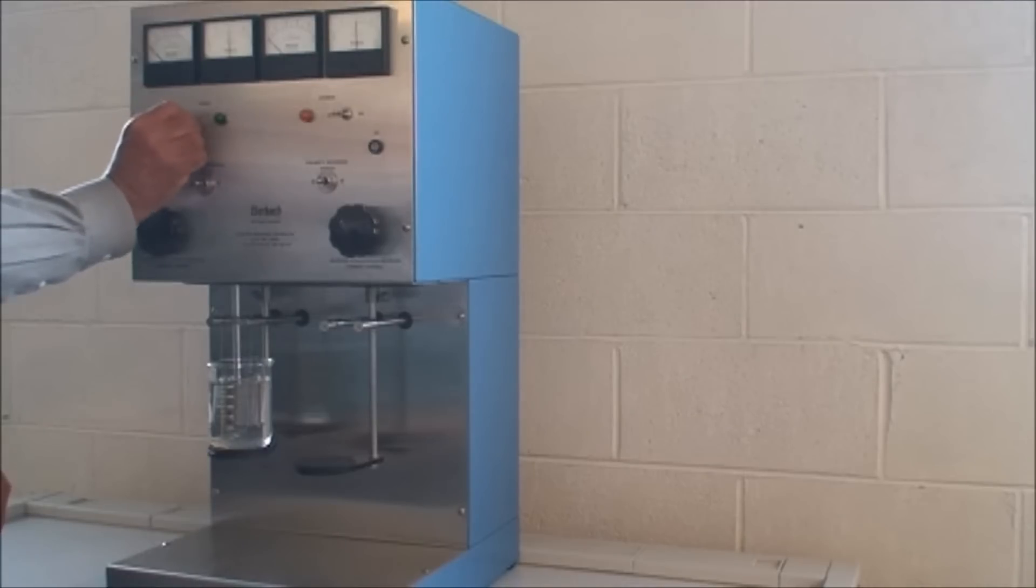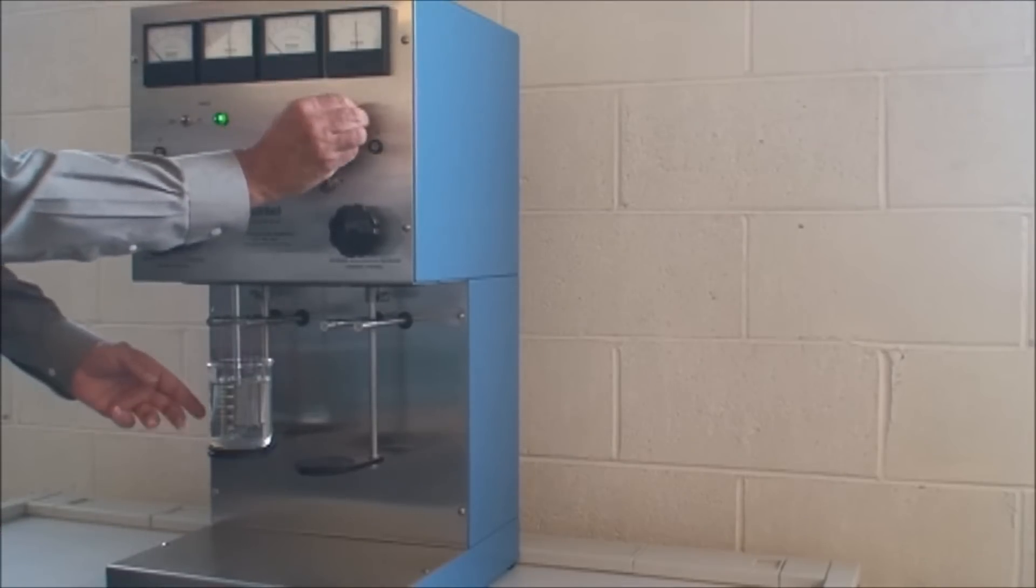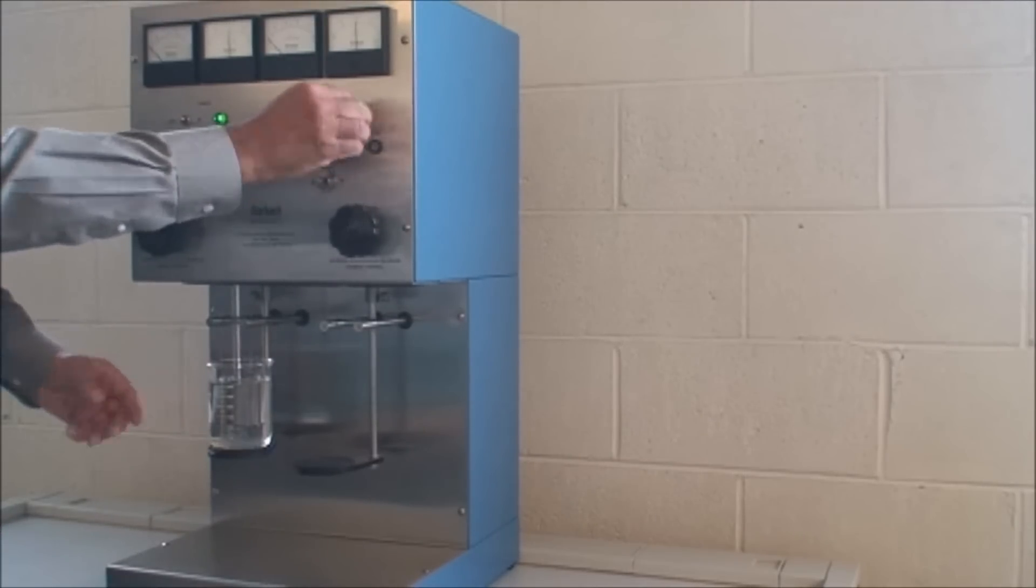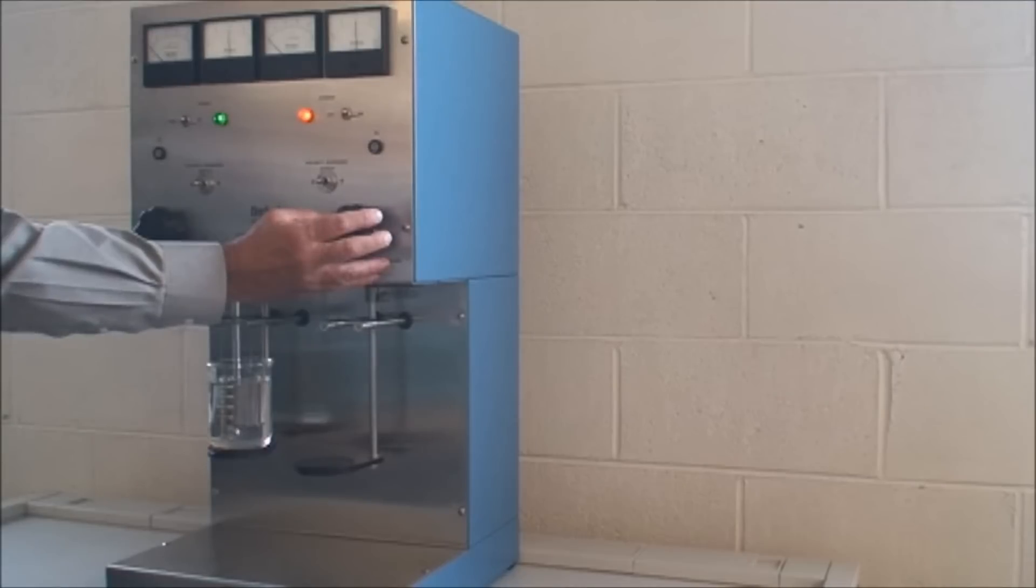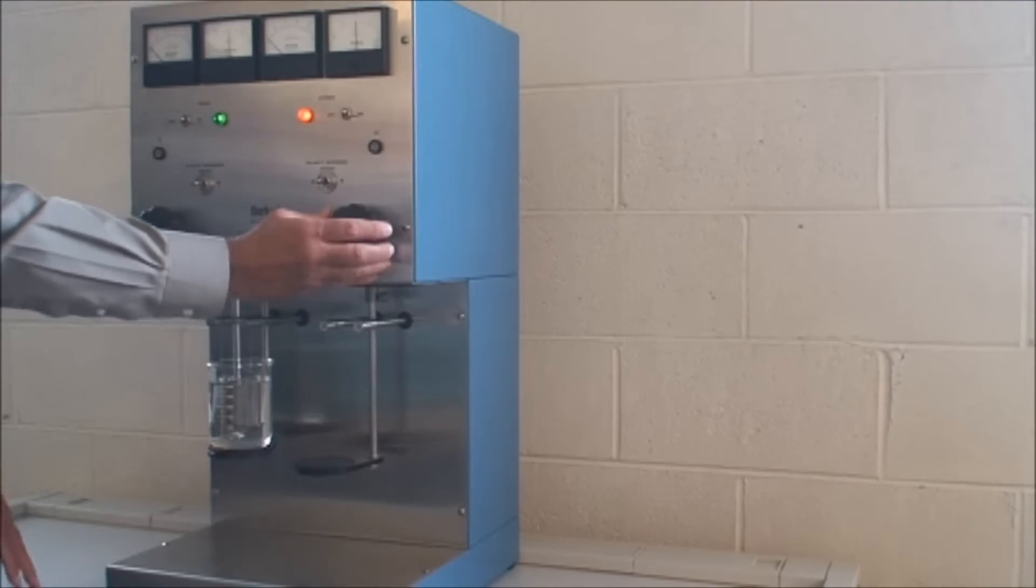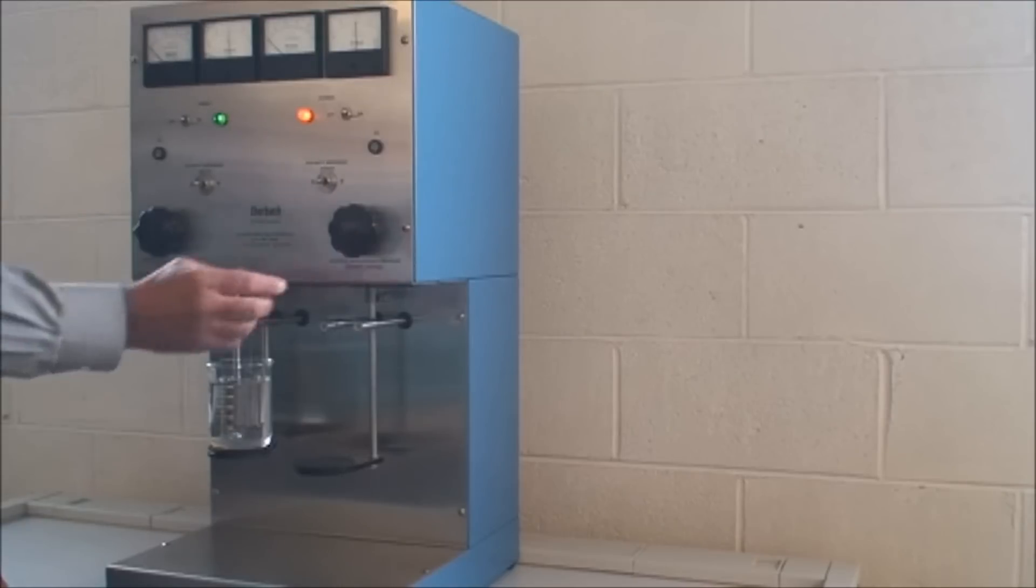You would turn the machine on, turn the stirrer on, and then adjust for the amperage and voltage. Typically you want about 40 milliamps per square centimeter of electrode surface area.